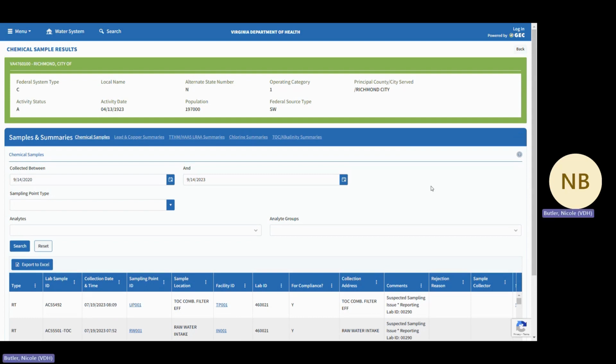This concludes the training for how to navigate to samples and results in Drinking Water Viewer.